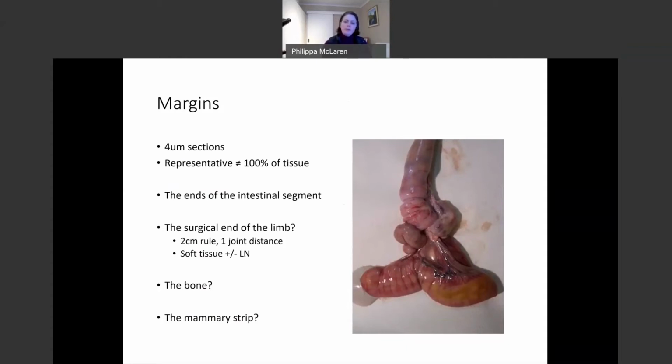For example, when the human medics and pathologists are doing cut-ups for certain excisions, they might take 100 glass sections and charge appropriately to look at that many pieces of glass. That could take one pathologist a whole day. And so you've got to remember that your margin is the best representation of the tissue that we can achieve in a reasonable manner, providing you the fastest service that you want.